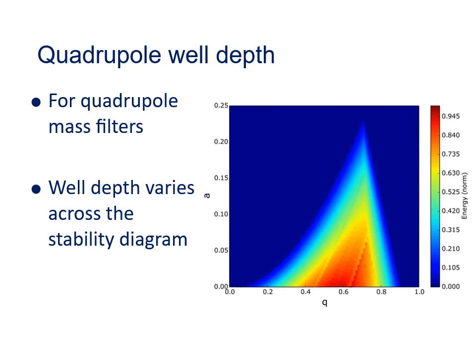To do this, we build a model of our quadrupole mass filter or ion trap in an ion trajectory modelling package. Then we create ions at the centre of that trap and fire them outwards with increasing energy until we find the maximum energy we can give ions and yet have them still remain trapped within the quadrupole field. And because in the model we have full control over all the parameters, for example the A and Q value, we can find how this trapping well depth varies across the whole of the stability region.